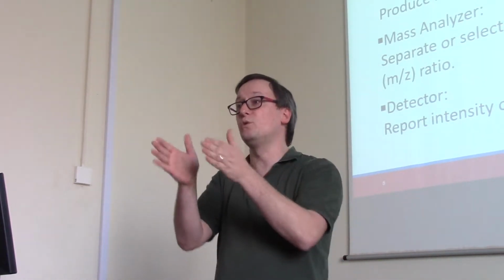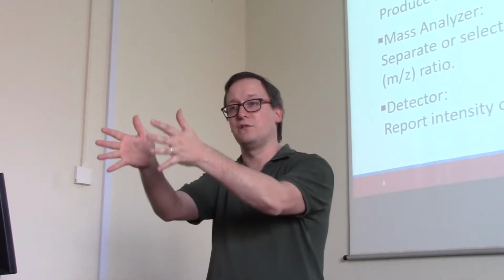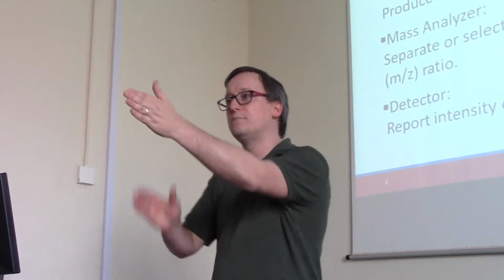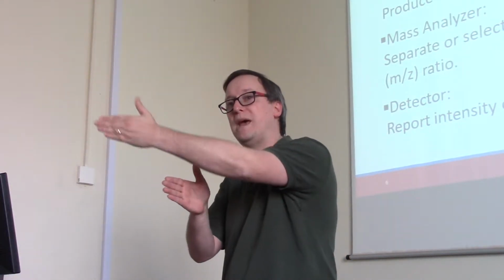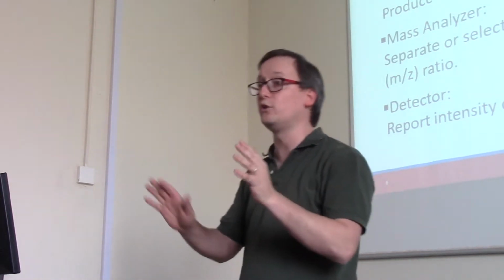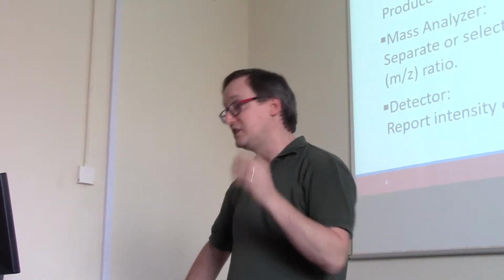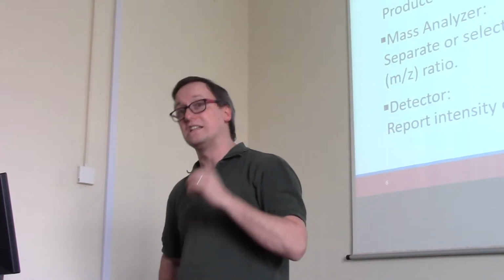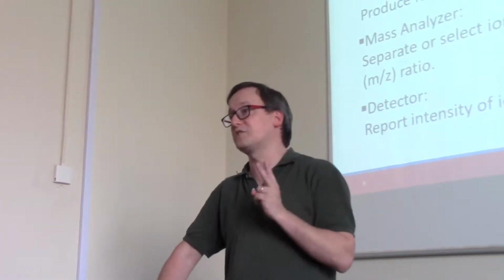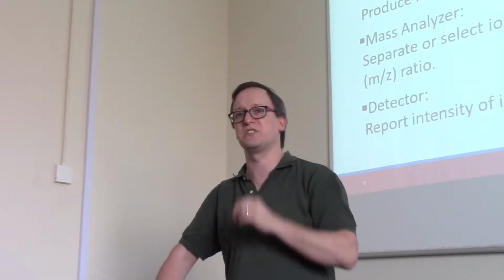Okay, so the old school sector mass analyzers would use this electrical field to bend the path of ions, and by the amount of deflection in its path, you could discern what its mass to charge ratio was. That's a very old school method, but I think it's one everybody can get their heads wrapped around. Today's mass analyzers are considerably more complex in what they can accomplish. The two that I spend the most time thinking about are Orbitrap mass analyzers and ion traps.